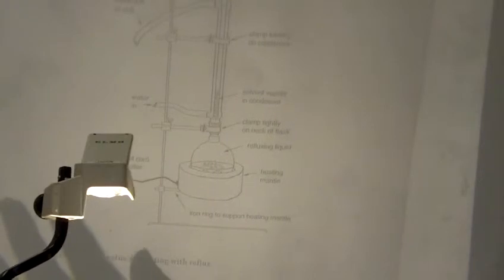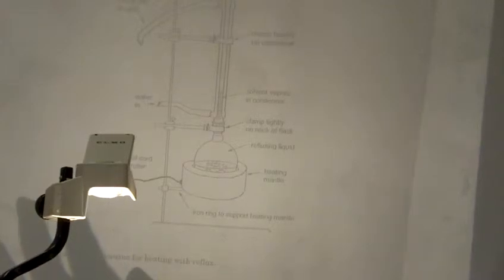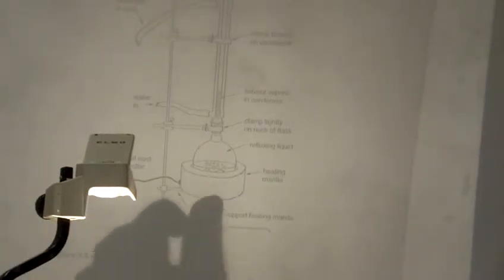So you'll get everything set up, and then have your lab prof check it, and then when you're ready to go, you'll plug your heating mantle into the Ohmite, turn the switch on, and control the heat with the dial instead of it going into the wall, okay?